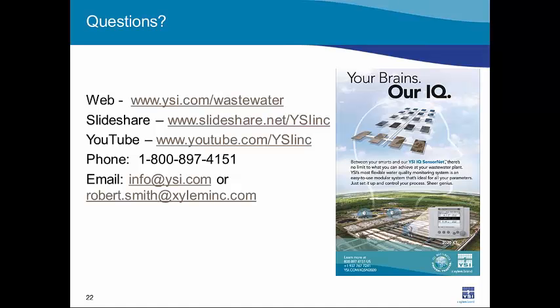Again, I appreciate it's going to be a little inconvenient, especially with a very long pole at the end of that sensor. But if you have 2 people, it can very easily be done, and as I said, we have a customer who's done that very successfully. So I apologize for not interpreting that question completely before, but hopefully those responses are very helpful.